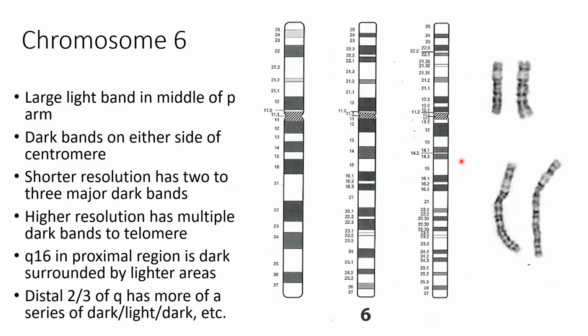All right. Okay, now we get to the C group chromosomes, which you'll have a lot of fun with. So we've got chromosomes 6 through 12 and the X, all of similar size. 6 is the largest, 12 the smallest. X is probably somewhere in the 6, 7, 8 chromosome size range. So this will be probably the group that gives you the most problems.